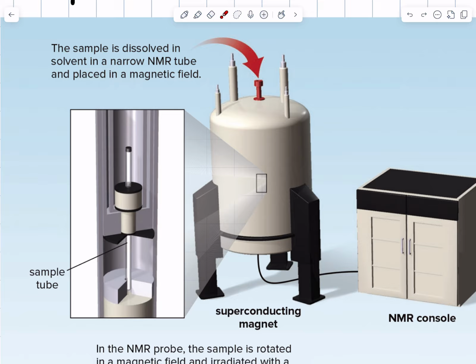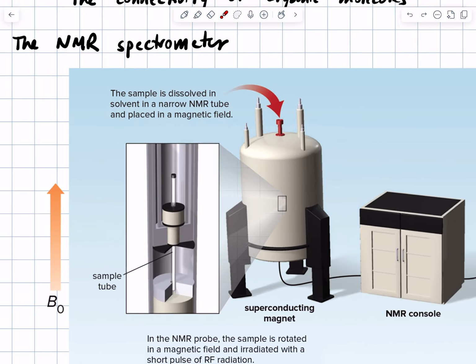It will mess with your pacemaker. And if you have loose metal on you as you get closer, it will rip the loose metal out of you and pull it towards the center of the magnet. So the rule is no metal within this line. And if you have a pacemaker, you get somebody else to approach the spectrometer.